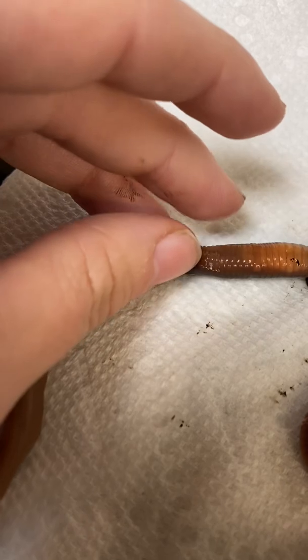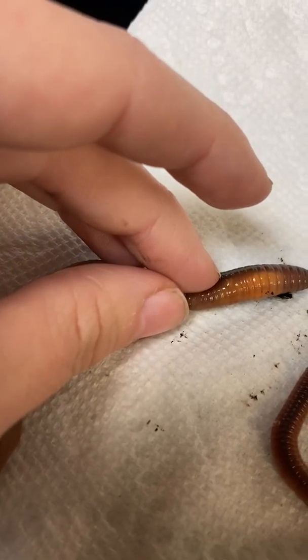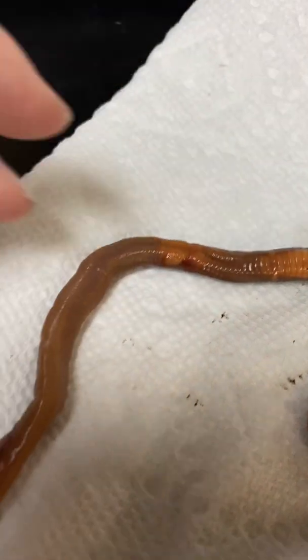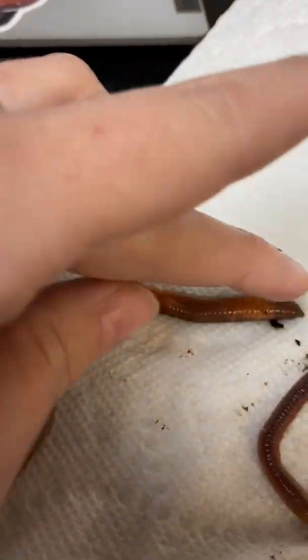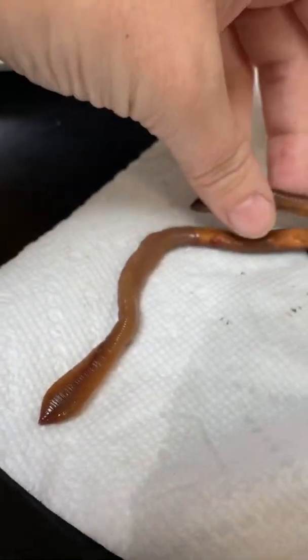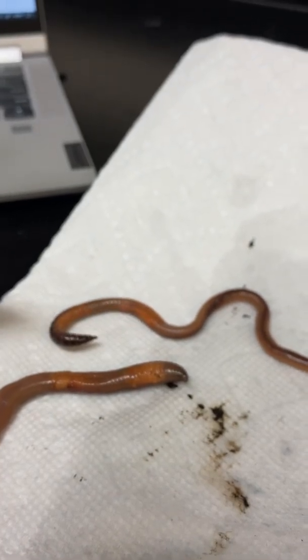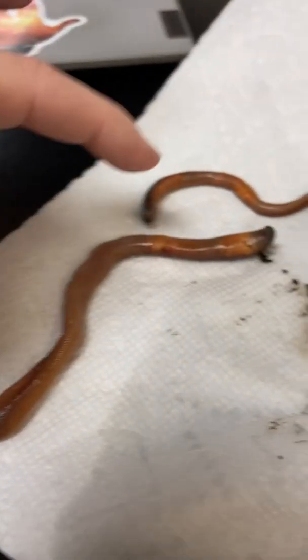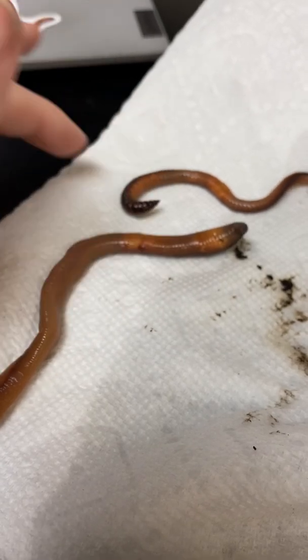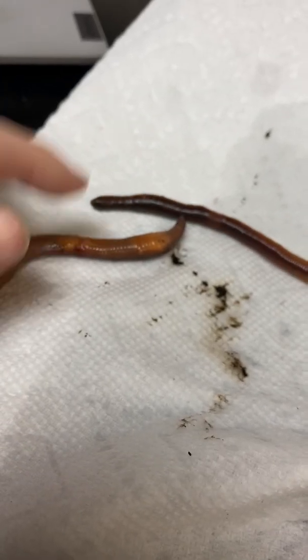Those little holes right there, those are the genital pores or the sperm ducts. So they attach right here at one end and the clitellum over here in the other one, and they exchange sperm. That's how they would do that. 30, what is the purpose and the function of the structure? So like I said, it's where the worm attaches to the other worm to exchange sperm and receive sperm. And it also secretes the cocoon around the eggs when it lays it.